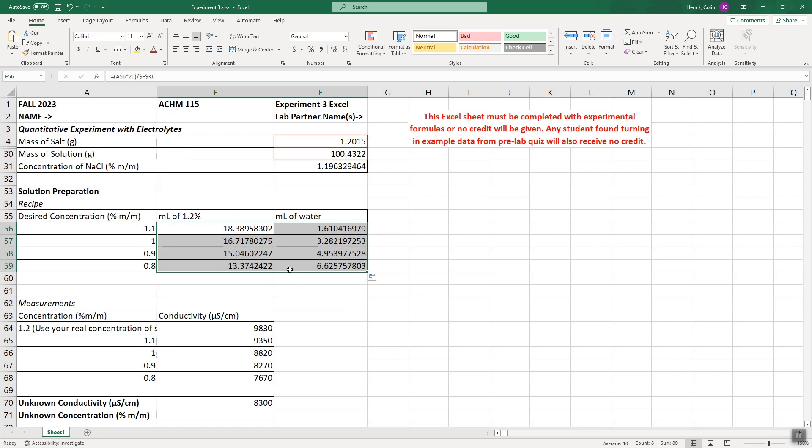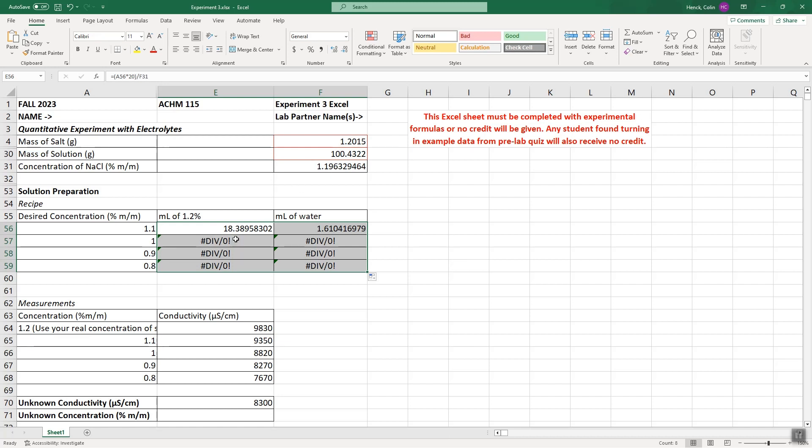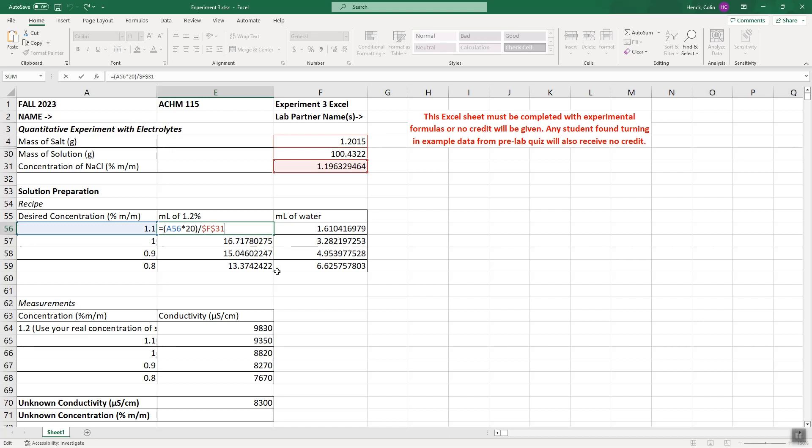Dragging down gives you 16.7 mL for 1%, 15 mL for 0.9%, and 13.4 mL for 0.8%, with corresponding water volumes. If you forget the dollar signs, you'll get divide-by-zero errors. Just go back, reselect the cell, and press F4 or add the dollar signs manually. Once you have all your recipes, the next step is measuring the conductivity of each solution using the MicroLab software.